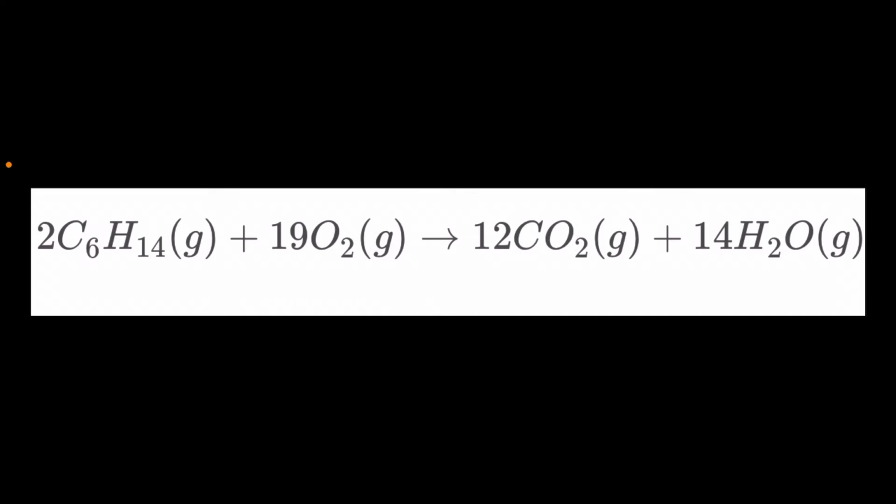Okay, so what's going on in this awesome combustion reaction is we started with that C6H14. That's hexane. And when we put it in the flask, we rolled it around so it would evaporate and build up pressure. Then we started to pour it down the slide.